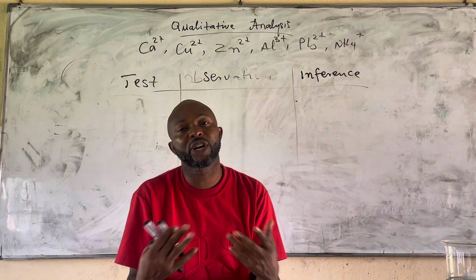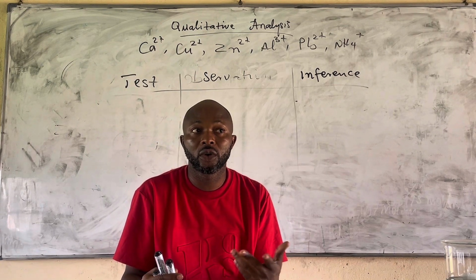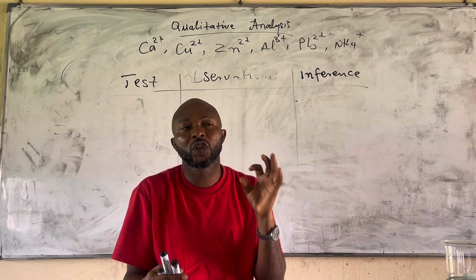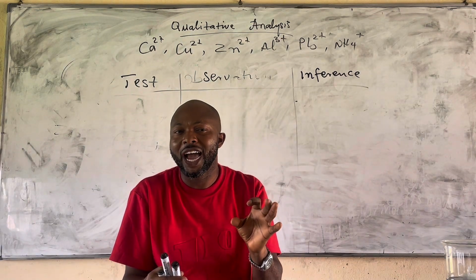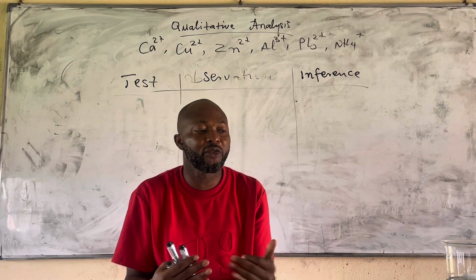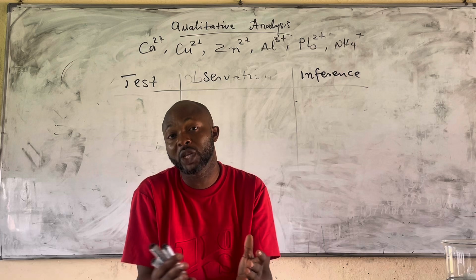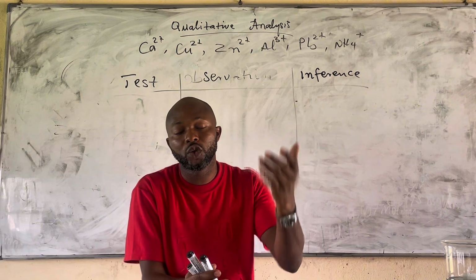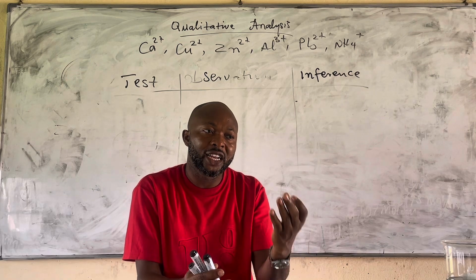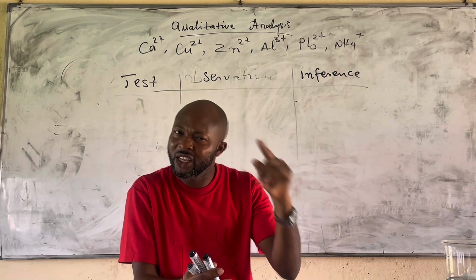So these are the basic preliminaries of cationic tests, which we will obviously carry out in the laboratory, but our understanding of the color which they exude and the reactions with sodium hydroxide and ammonia are very essential, because when you are confronted with the challenge of carrying out the experiment without anybody guiding you, what you see defines what your inference should be. And everything is based on physical observation. What do you observe? Is it blue? Your mind should go to copper.